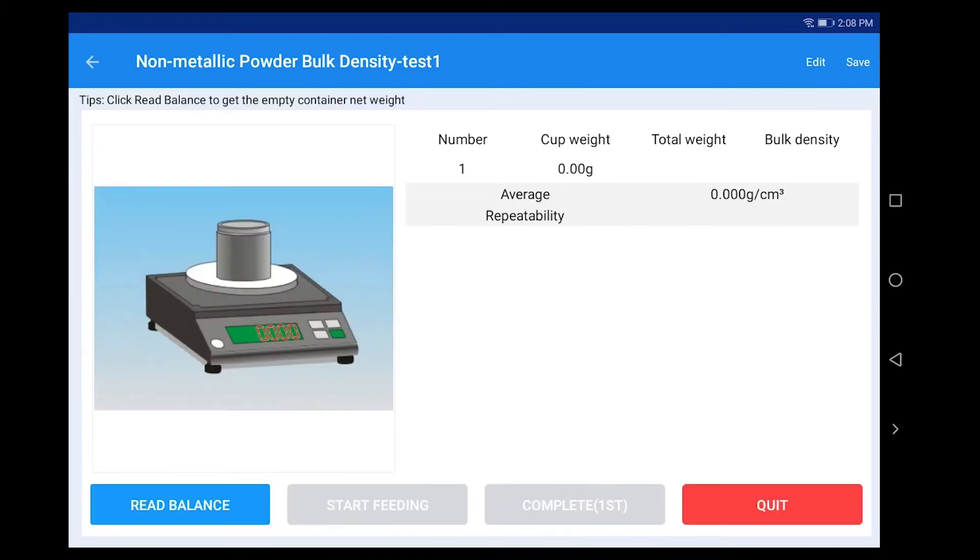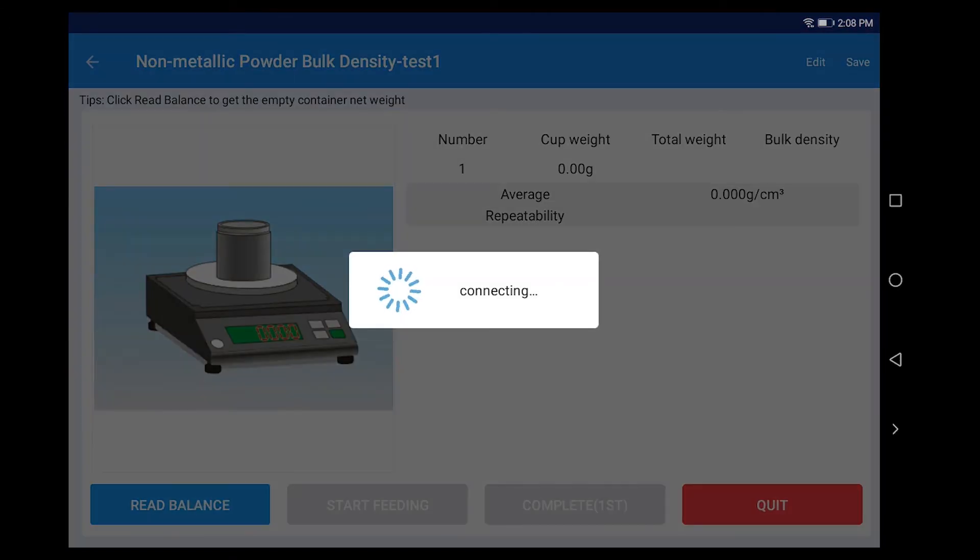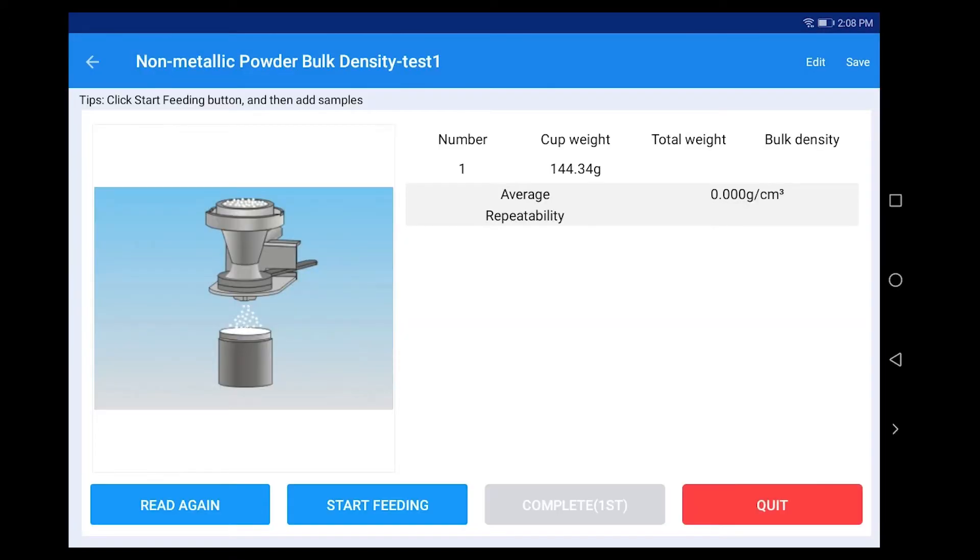Click Start Measure. Put the non-metallic powder bulk density container on the balance. Click Read Balance to read the net weight of the non-metallic powder bulk density container.